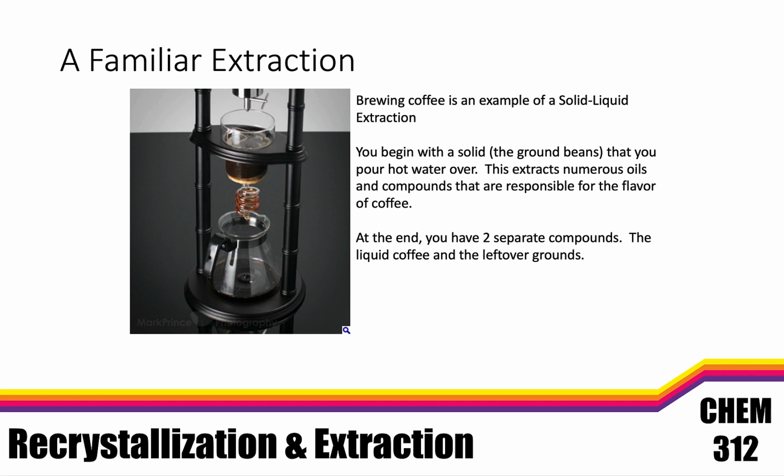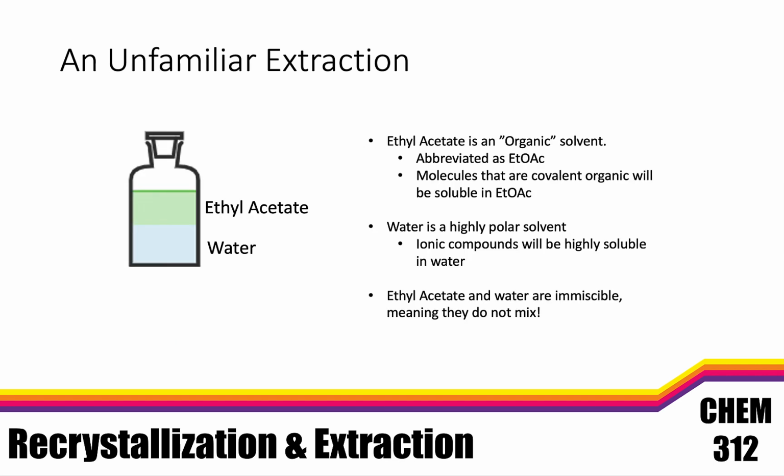And at the end, you have two separate compounds, right? You have the liquid coffee and you have the leftover coffee grounds. What we're going to be doing this week is actually an unfamiliar extraction, right? Where instead of looking at coffee, we're going to be doing a liquid-liquid extraction.